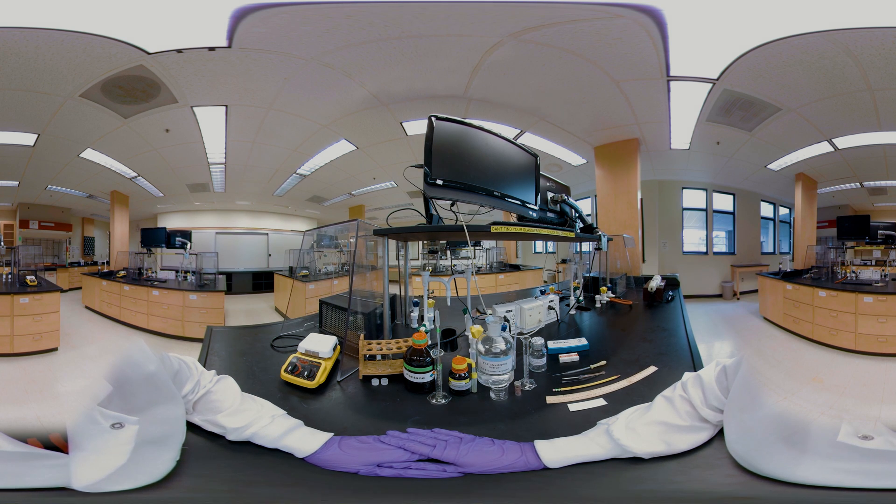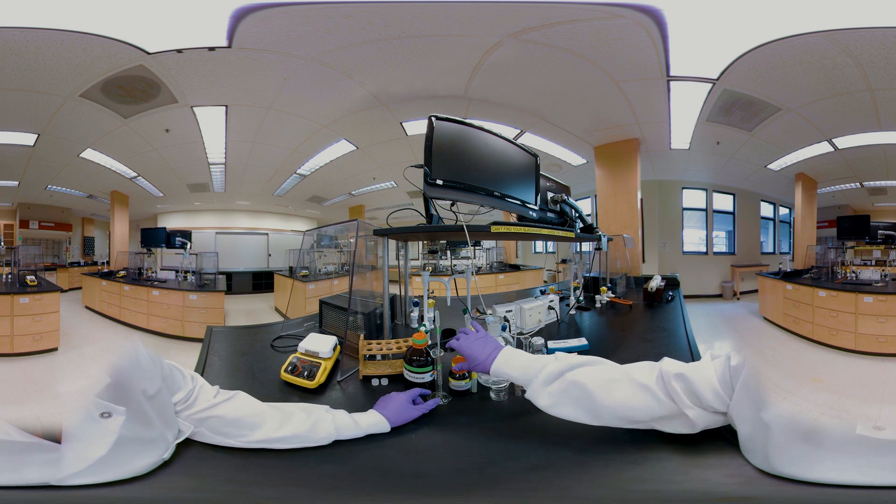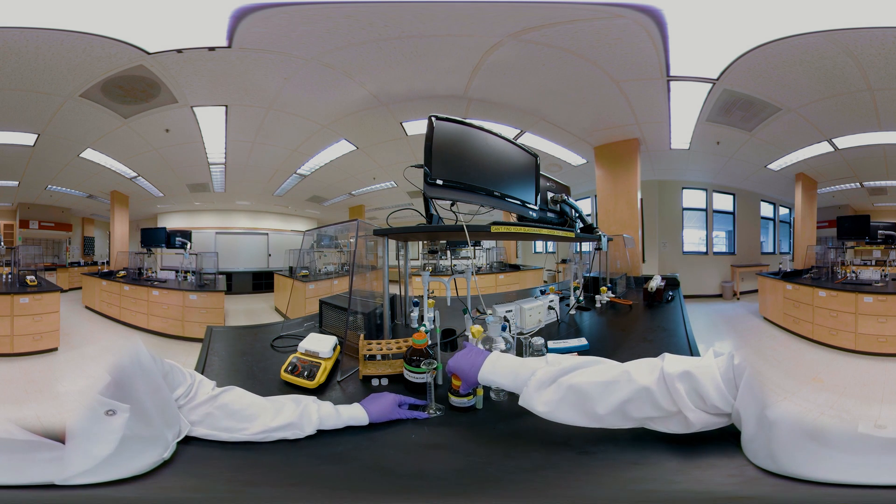Let's start by extracting the pigments from the spinach juice. Add 3 milliliters of spinach juice to the screwed cap test tube.